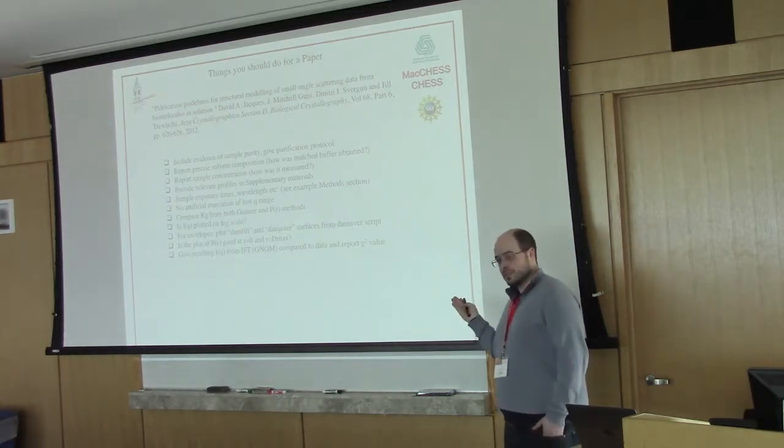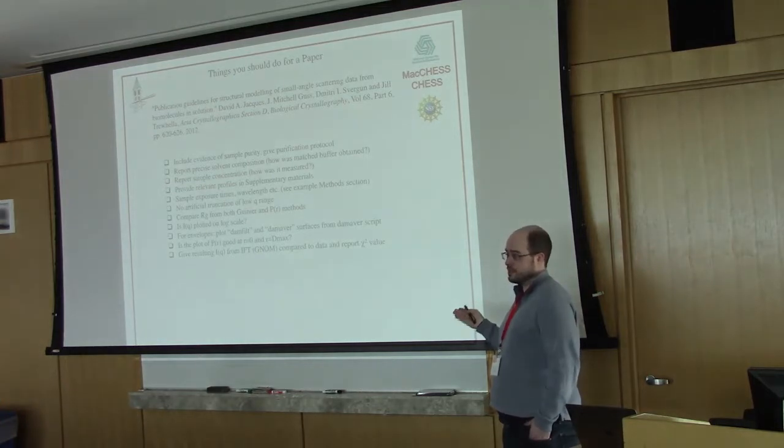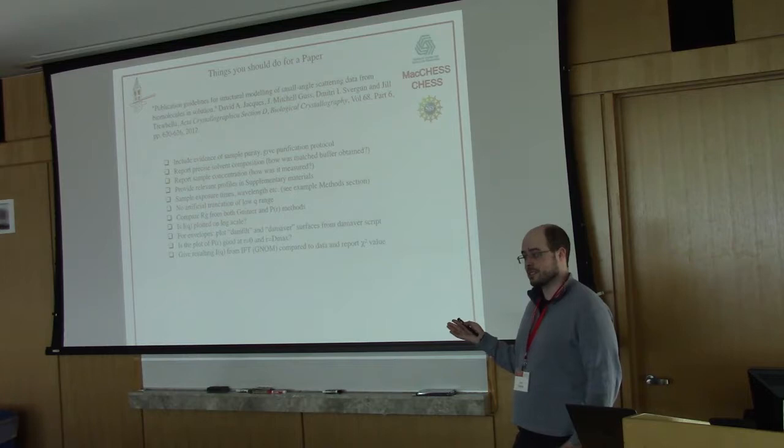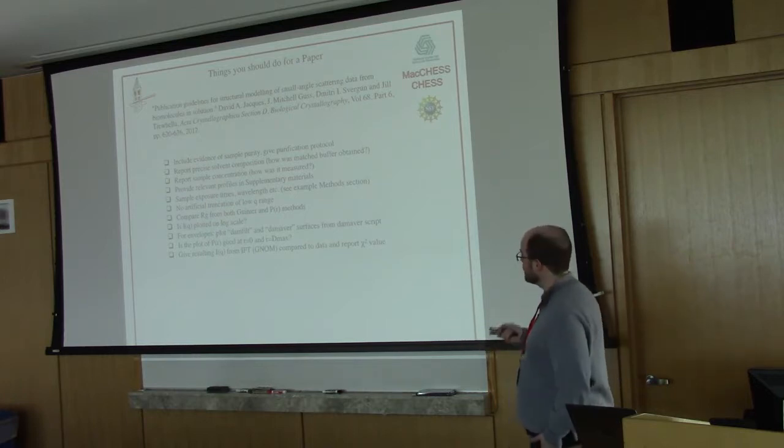Does the P of R look good? Tom went into various things that can go wrong with that. But make sure you're showing the P of R function somewhere so people can assess whether or not you did a good job with that. Again, that can go in the supplement, but that's the kind of thing that needs to go in there.